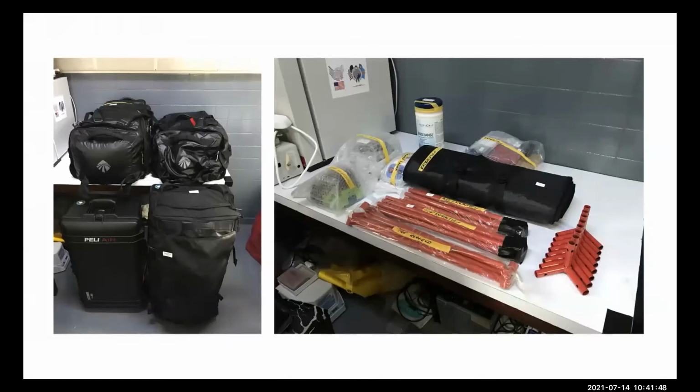Last thing I want to talk about is the lab in a suitcase, and these very neatly packed bags are the ones that Ian and myself packed for a trip to the DRC to go to the INRB in Kinshasa. And this is all of the equipment in those four bags that's required to set up a mobile lab with containment for pre and post PCR. And I'll show you how that works.